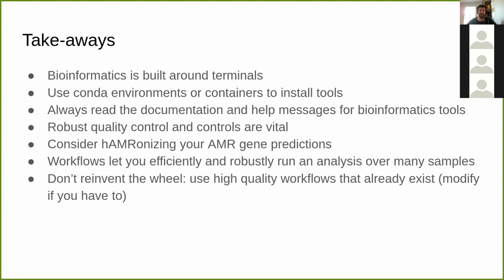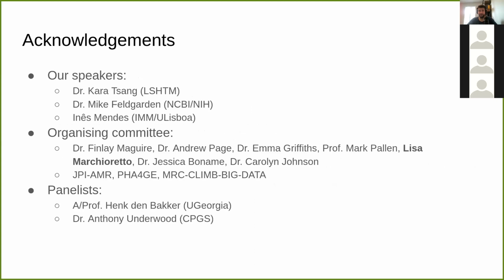I would strongly consider using harmonization for your AMR gene detections, because it makes it easier to change and compare across different AMR gene detection tools. And workflows let you efficiently and robustly run an analysis over many samples. And especially, don't reinvent the wheel. Many high-quality workflows exist, and modify them if you have to.